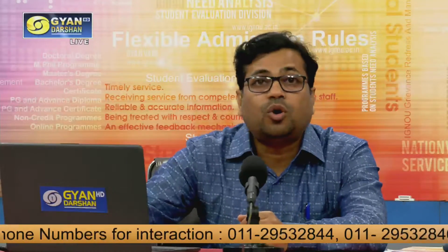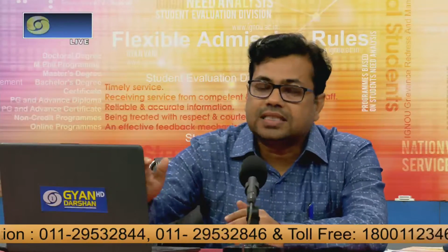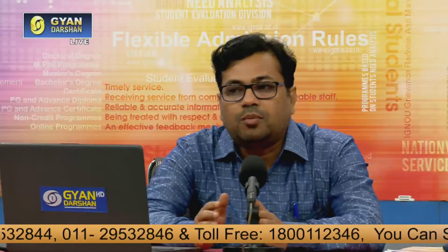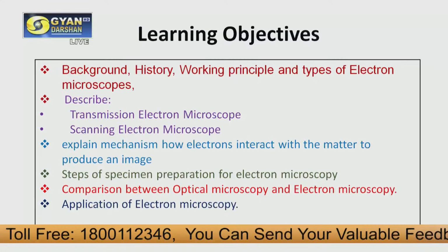So today we will discuss what electron microscopy is, what its types are, and what the working principle is. In this session I will cover the background, history, working principle and types of electron microscope.